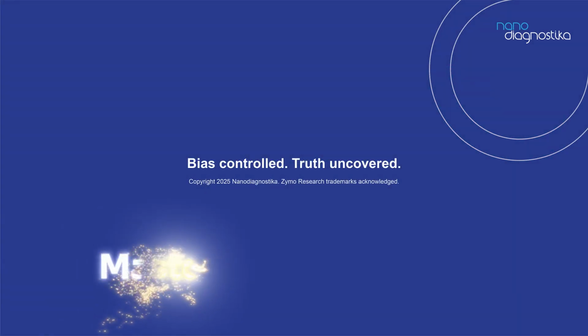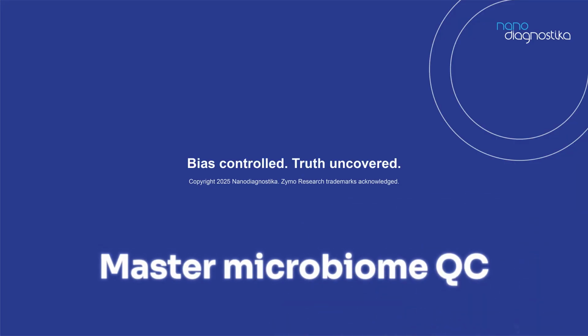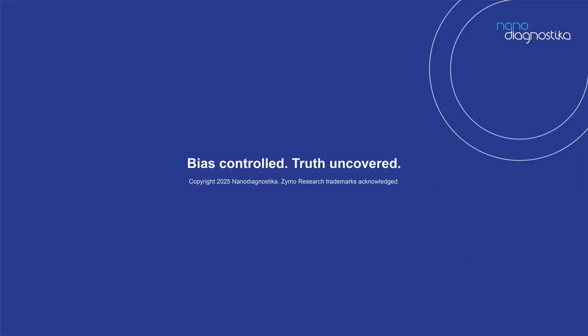In summary, mastering microbiome QC with whole cell and DNA standards ensures that your microbiome insights reflect reality, not workflow artifacts. With bias under control, you can trust your findings and focus on the science, delivering real, actionable insights from your microbiome data.